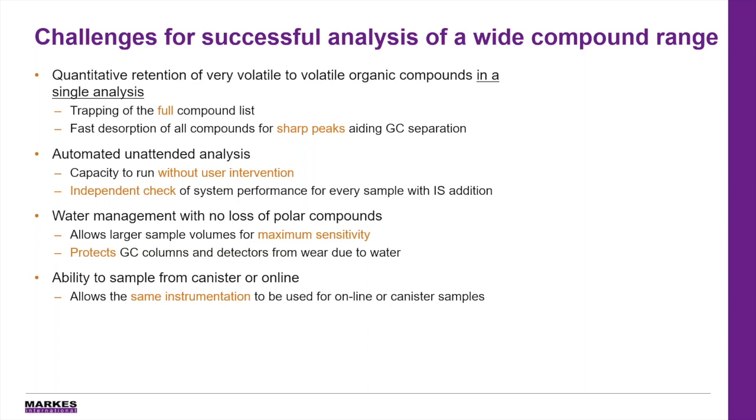Now, key for formaldehyde is the ability to sample from canisters and online in the same bit of instrumentation. Now, in the Chinese method, there's a lot of discussion currently about whether formaldehyde will actually be included as part of the list, and that's the main reason it's not been released yet, apart from the global pandemic as well.